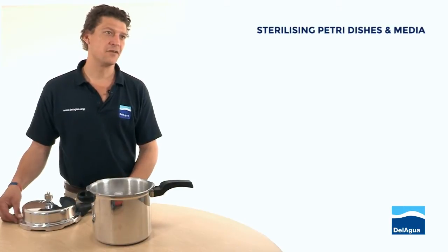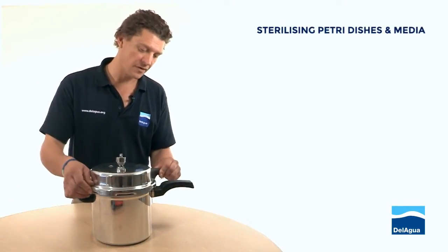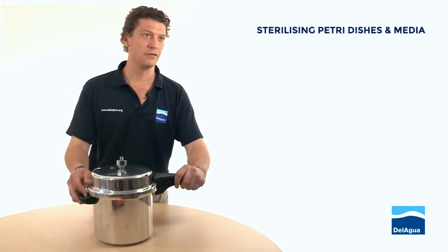It doesn't matter what type of sterilizer you're using, there is going to be a way to lock the top to the body of the main vessel. Always read the manufacturer's instructions and they'll point you in the right direction.